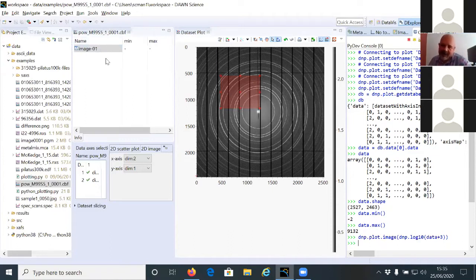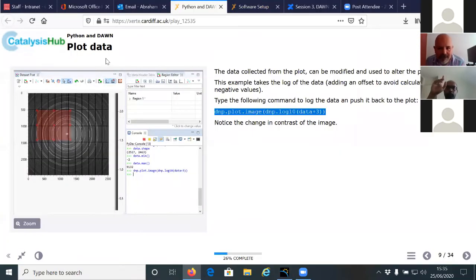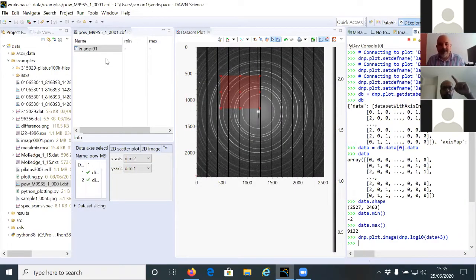So that's at least what we can see so far. Is everybody up to this point okay? Abraham: Yes, I see the image got very clear when you applied this logarithmic command. And the circles got brighter, meaning that you are enhancing the signals. Yes, that's a good idea. That means you are filtering your data better.